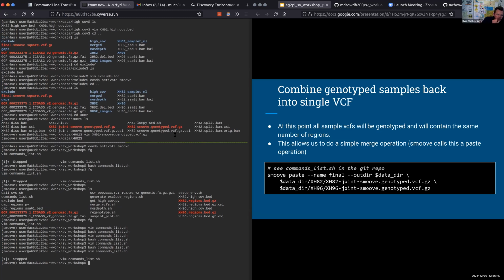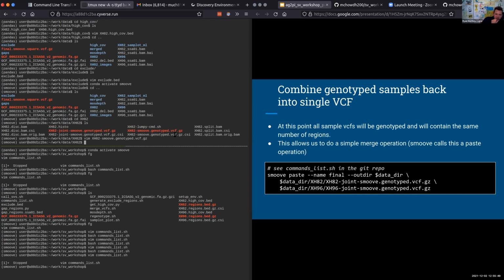Hang on, Murad. I just want to make it clear that we did 2 types of merging. We first took all of our individual sample variant calls, and we retained variants that were observed just in one sample by themselves, and we combined variants that were observed in multiple samples to come up with one unique list of structural variants. That was our first merge.